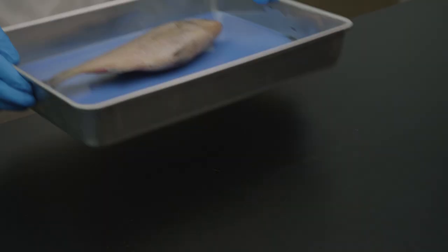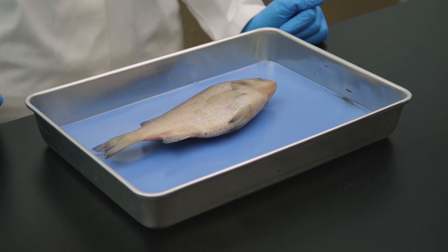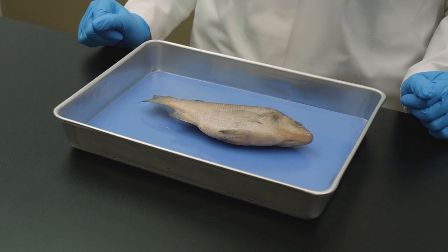In our last lab, we completed the dissection of a frog, which is an amphibian. Now we will turn our attention to an aquatic vertebrate, the perch. We will first examine the perch's external anatomy, and then we will study its internal anatomy. The perch is a common bony fish that lives in freshwater lakes and rivers. The average adult perch is about 7 to 10 inches, or 18 to 25 centimeters long.